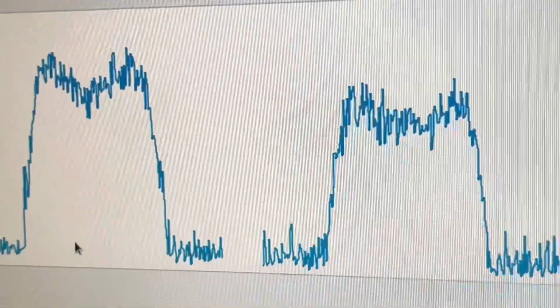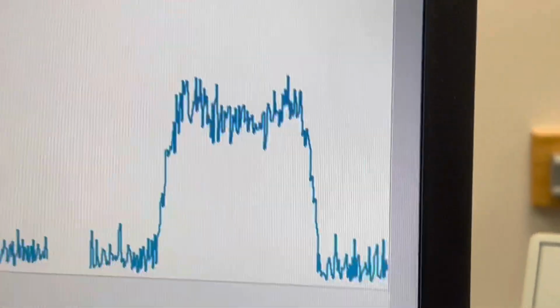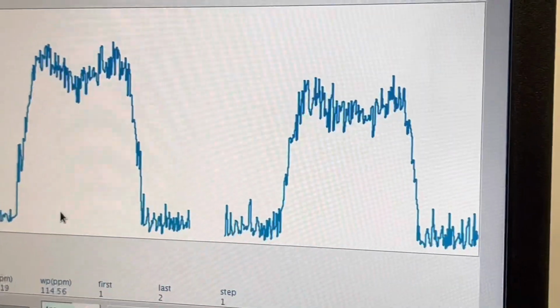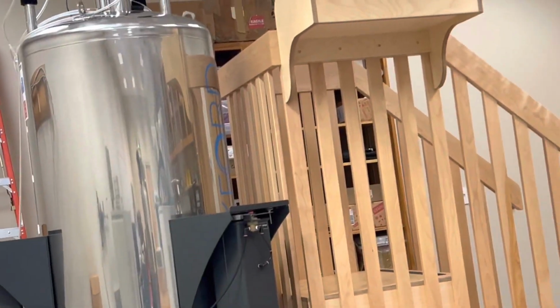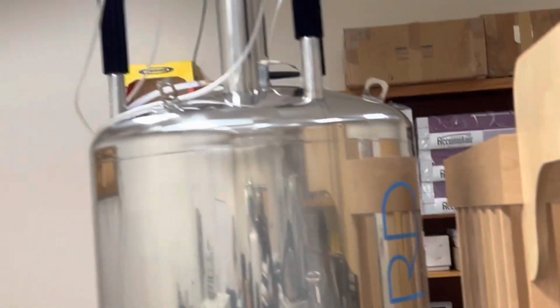It is completely different from the Bruker NMR software. This is a Varian NMR machine, a 500 megahertz Varian. This NMR is named Oxford, from Varian, and their software is VNMRJ version 4.